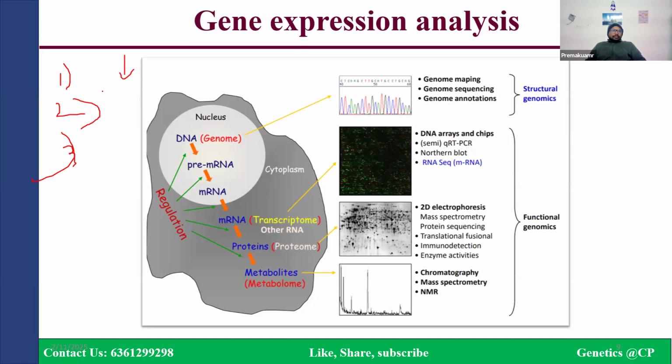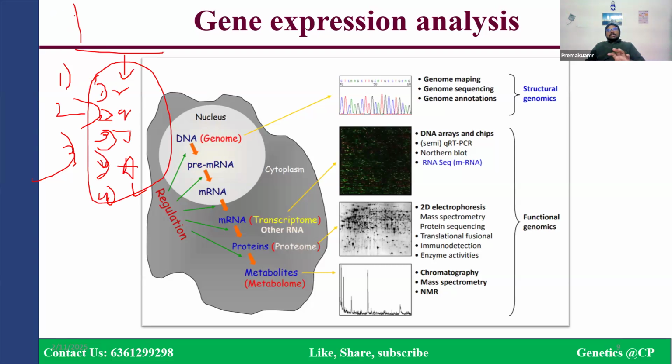First we receive the raw data, then we go for quality check, then trimming, then alignment. Then we have variant annotation and data processing for further uses. This is the overall protocol of your sequencing. Yesterday we just discussed how sequencing happens.